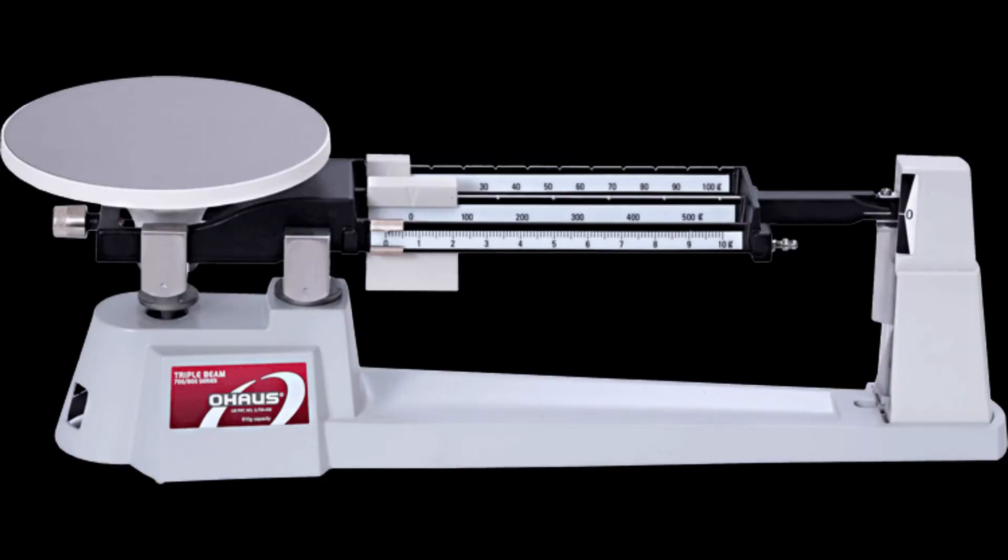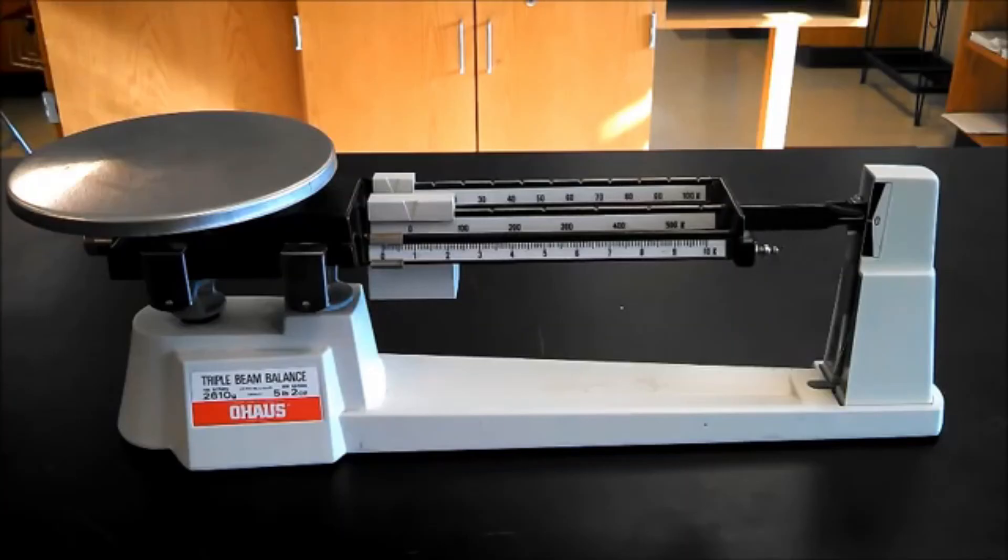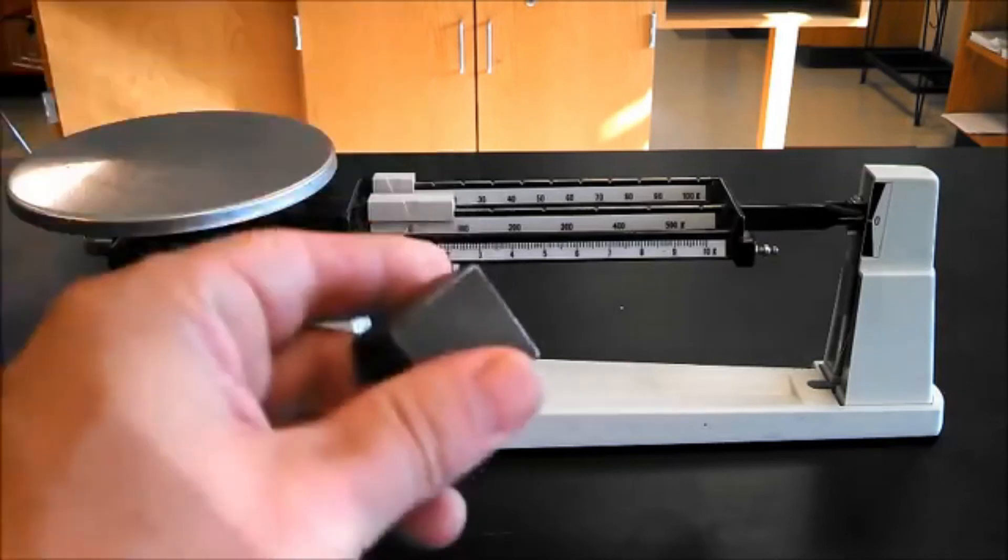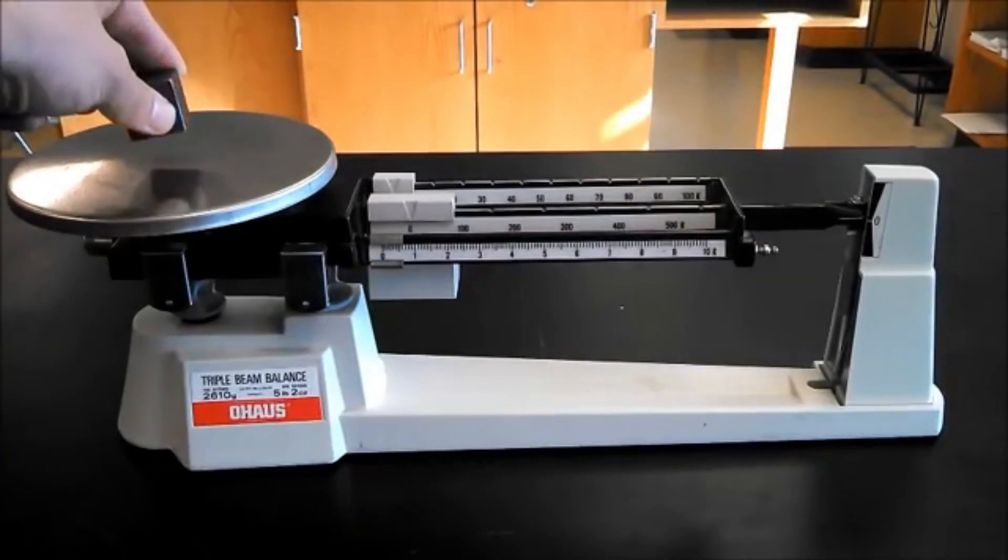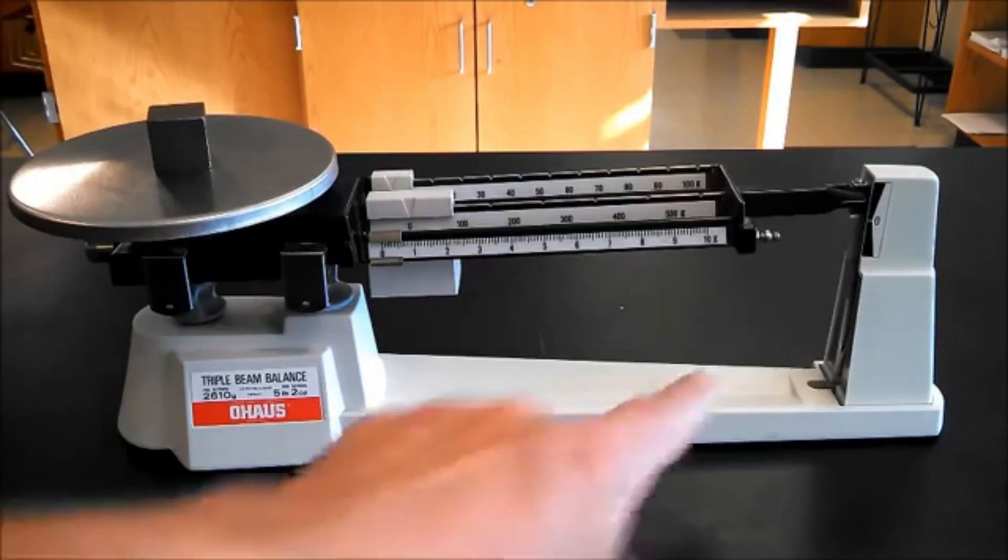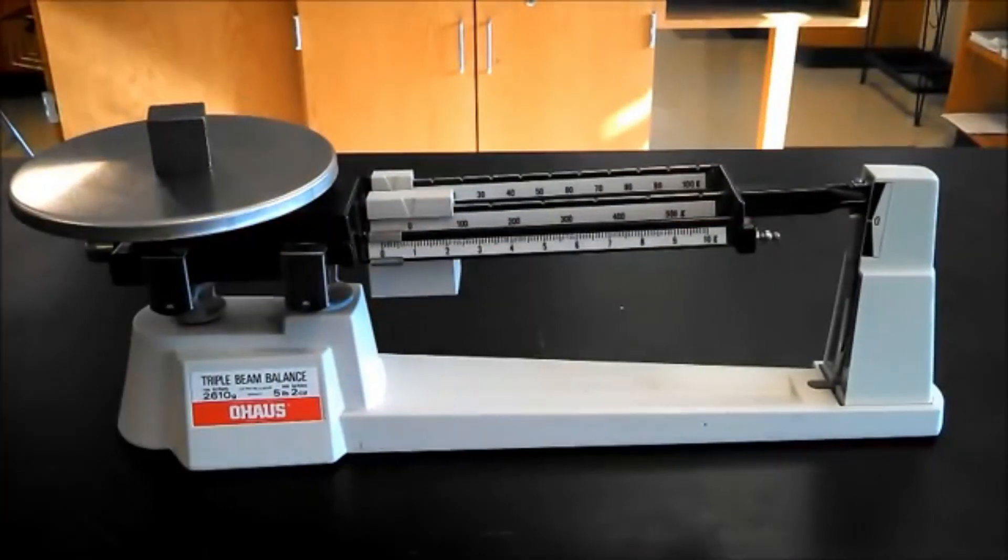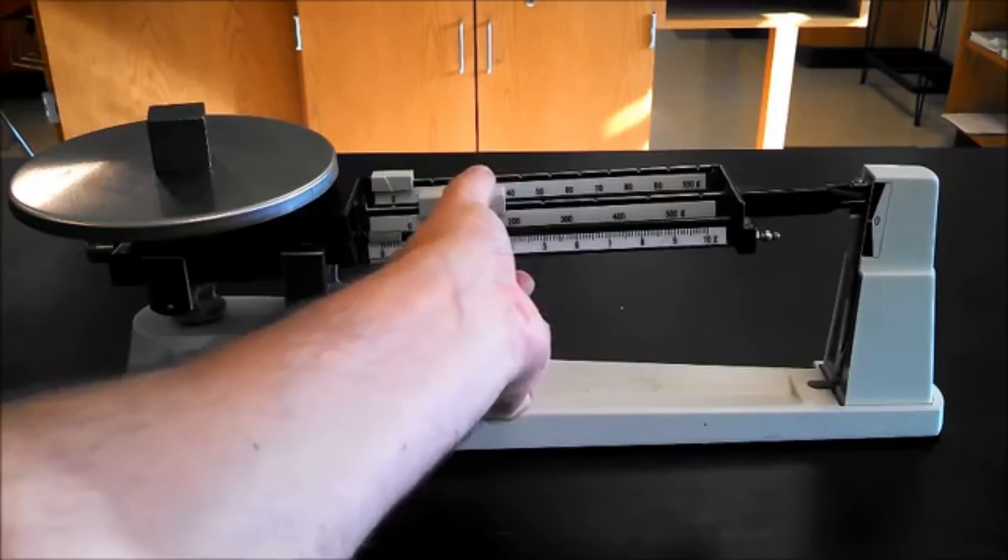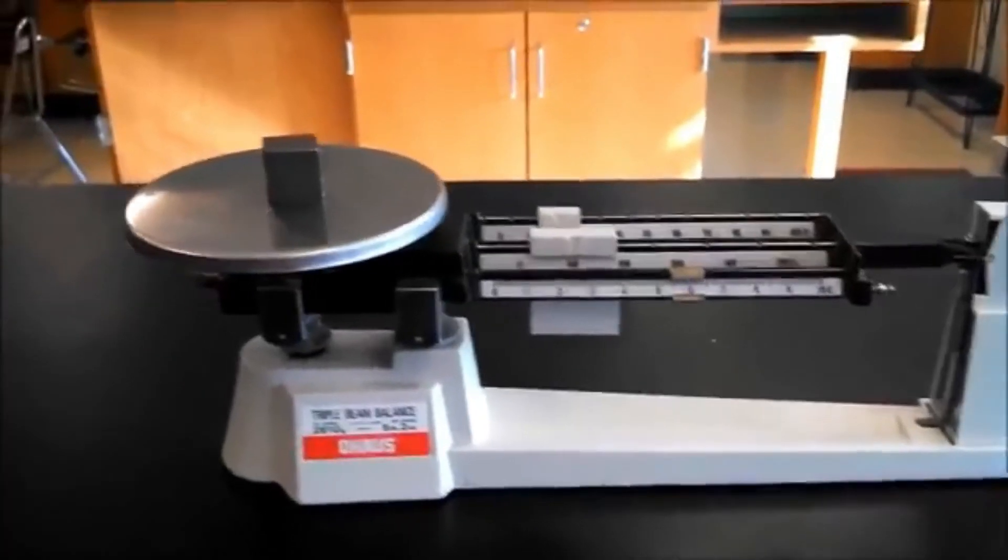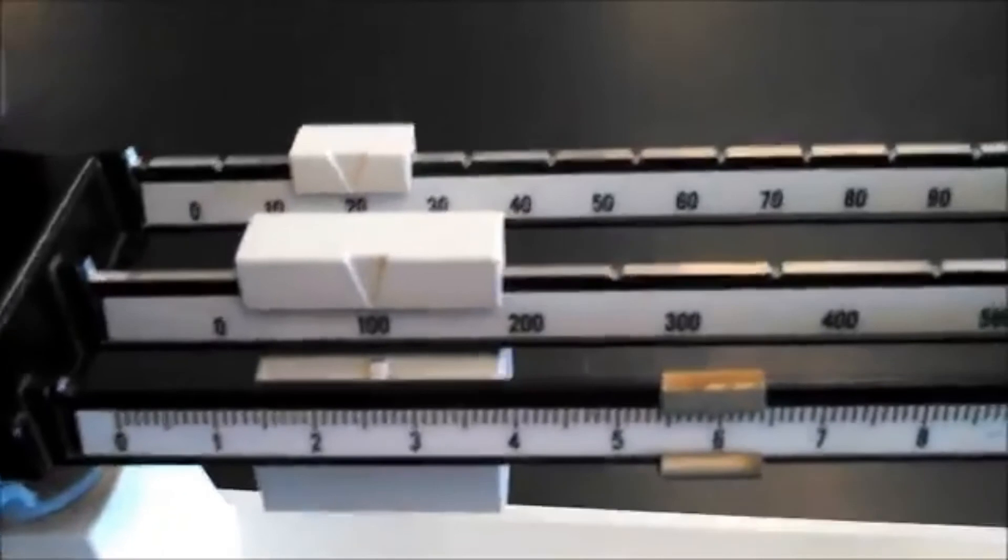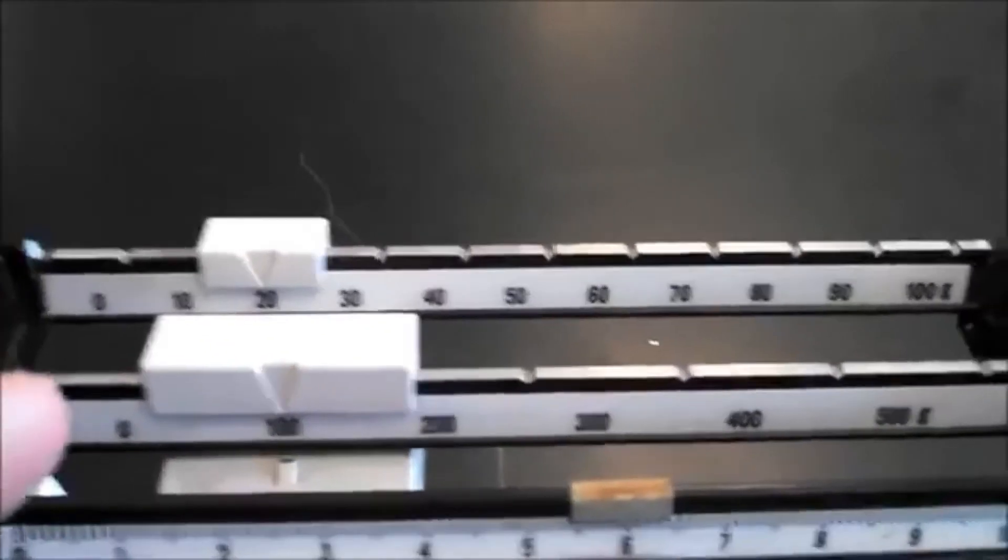Triple beam balance is the equipment that we use to measure mass in laboratory. It is composed of three beams, therefore it is known as a triple beam balance. First we need to make sure that the arm lines up with zero. When we place a weight on the balance, the arm jumps up due to the mass of the object. Then we need to bring the arm back to the zero point by moving the weights along the beams like this. After bringing it back to the zero position, we can read the mass of the object. As shown in this video, the mass of the object is 125.9 grams.